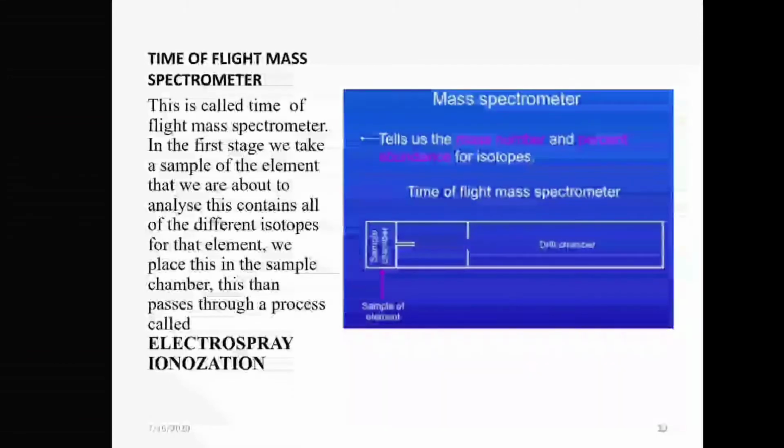Ions of different sizes, that is, heavier, medium, and lighter masses, will be measured, and the TOF will measure how long these ions take to fly through the mass spectrometer. They have a constant speed. This is a very important point to remember. These ions, with their different sizes, have the same amount of kinetic energy.